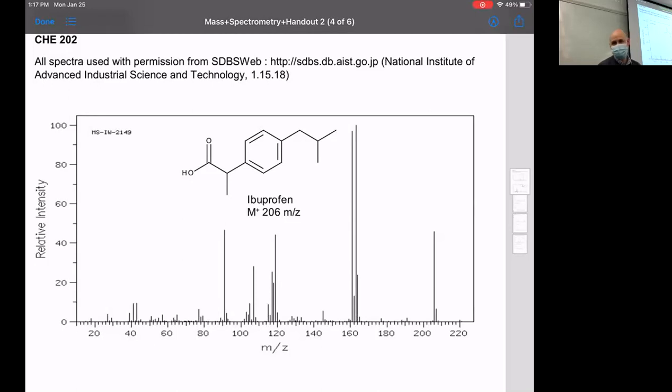And the mass spec, it's done this enough times that we can exactly say how much each of those ions weighs. So it's actually counting specific ions. So it might be saying 8 hit here and 60 hit here, et cetera. The single most important peak for us is the one that is farthest to the right, the tallest one in that chunk. So you want to look farthest to the right, which would be these guys right here.